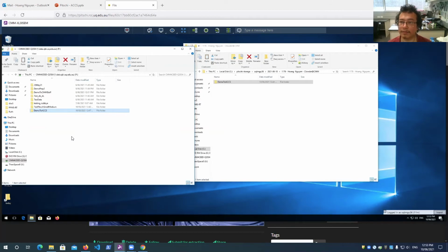Thanks, Juan. We can use Bio-Formats, right, for the metadata? Yes. In fact, as part of this project, one of the first things that I did was create an extractor for Bio-Formats. I can give you some data sets and we can see how it handles optical microscopy. Actually, I have some of the files. Later on, I will show you some of the files from some of the collections.